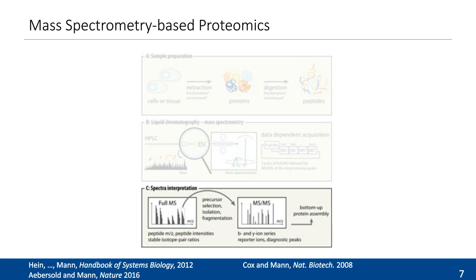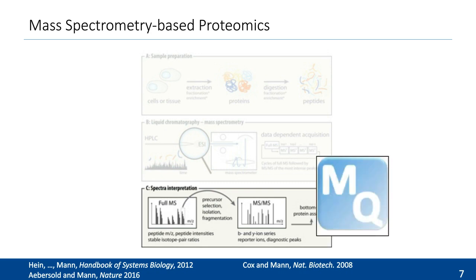And we typically use this with the MaxQuant software that was developed by Jürgen Cox in our group here. And you will hear later on in the second part of the talk more about this and how this is adapted to the timsTOF.